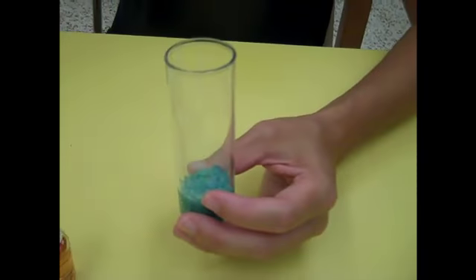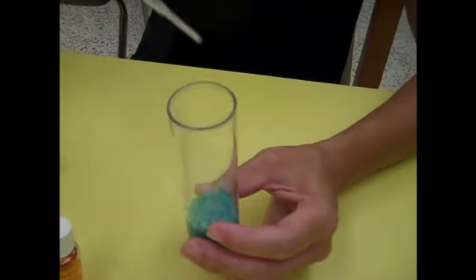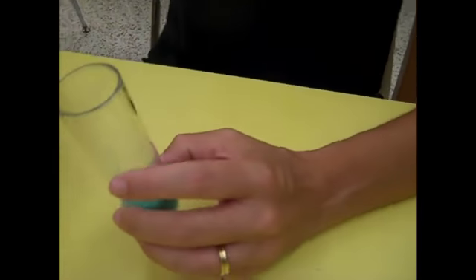Okay, and see if you can do that. It looks all blue, but you hold it upside down and it doesn't run. That's probably about right. I might add just a little bit more in there. Okay, and then you would have a cap ready to go.